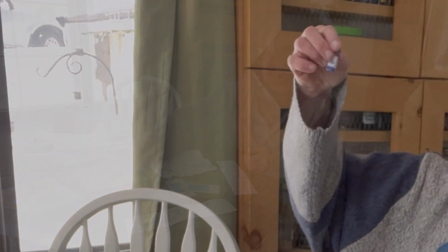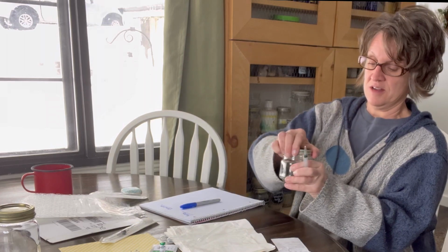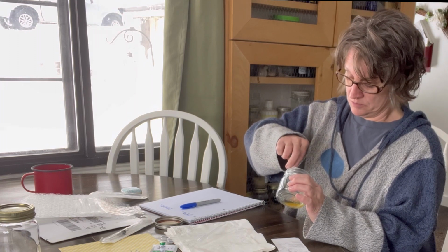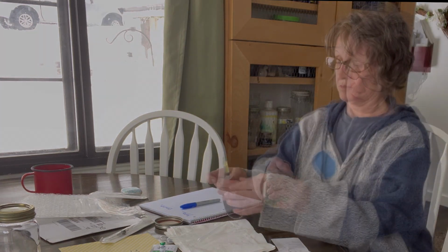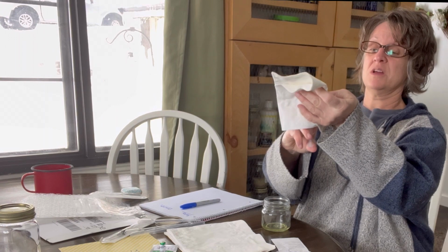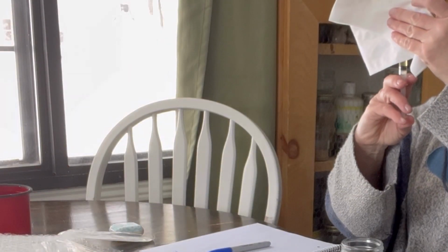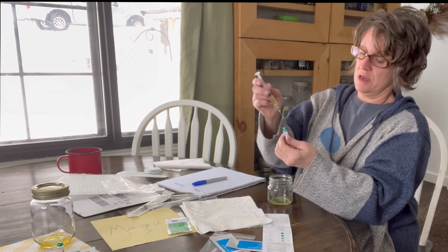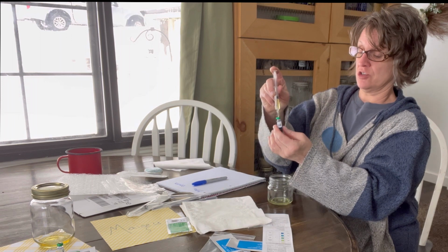As long as the little blue tablet, I think we're good. Okay, so this first one. I'm going to, it said be careful not to get any air into them. So there we go. All right, this one is Macy's. It instructed to make sure that there is no air in it. So I did that and made sure there was no air, and I'm covering it up.